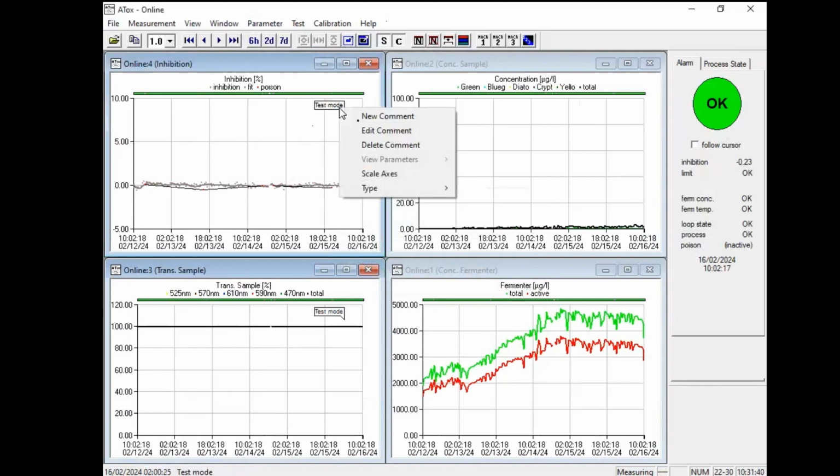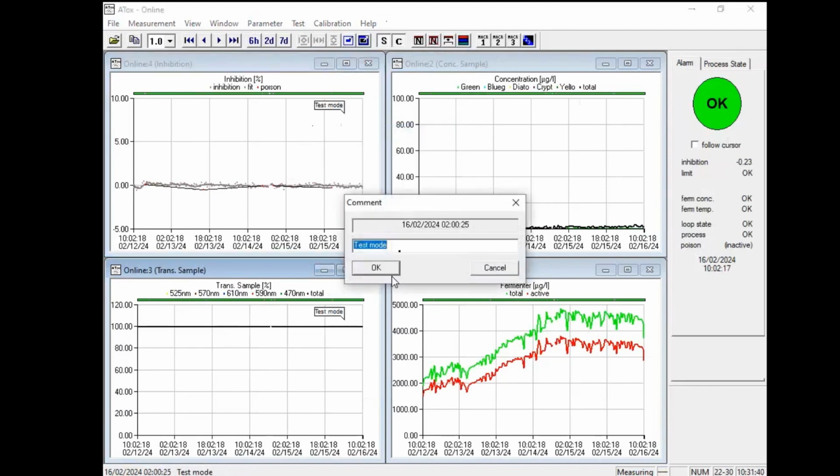You can also edit it and say, oh, test of toxin started.